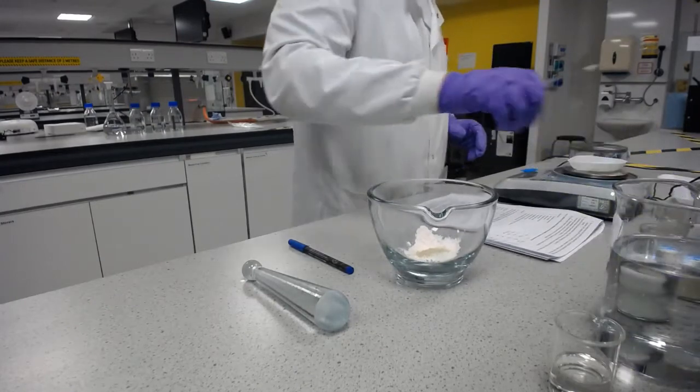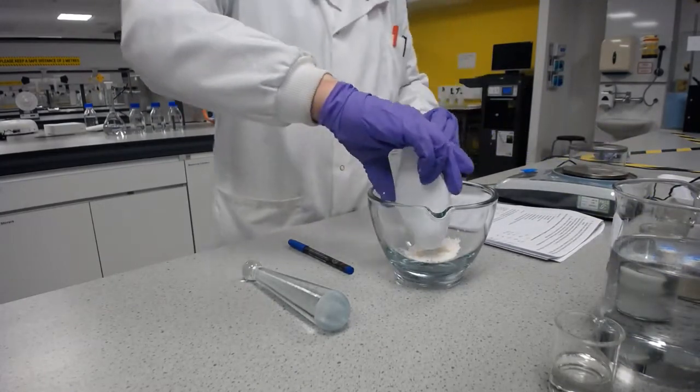Much more accurate weighing from me there. Let's get that in there as well.